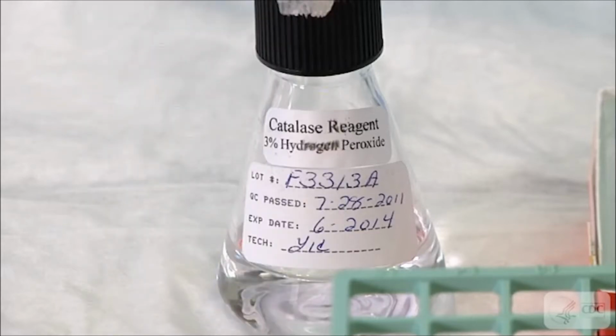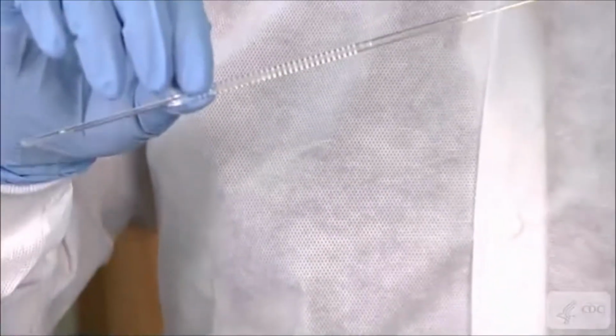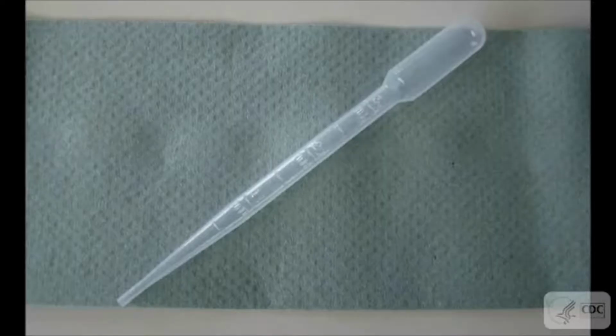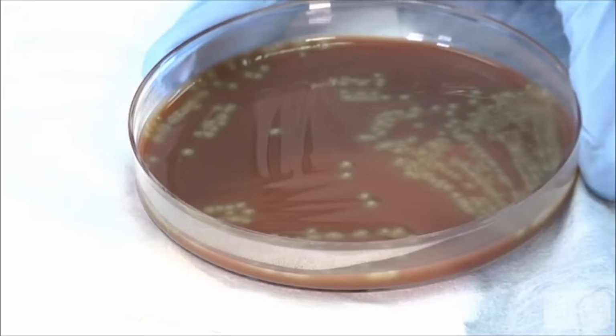For these tests, a 3% solution will be used, but a higher concentration of hydrogen peroxide can be used for other bacteria. You'll also need sterile wood applicator sticks or plastic loops. Avoid using wire loops, as they can cause false positive reactions. You'll need pipettes, biohazard waste containers, and young colonies of bacteria on agar media. These colonies should preferably be 18 to 24 hours old. Use blood agar or chocolate agar media.